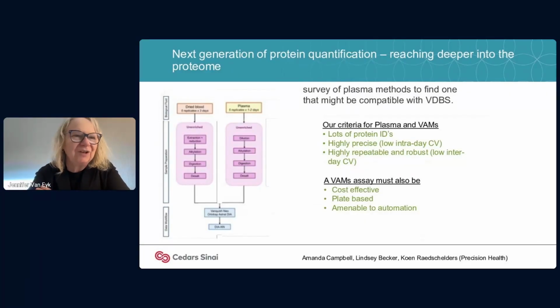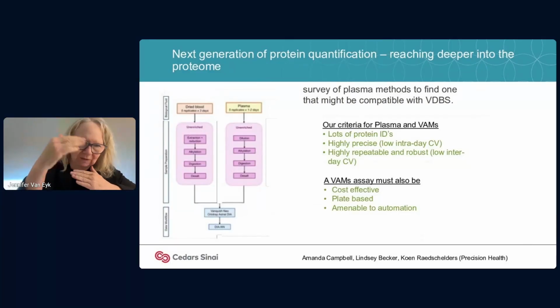Generally speaking, in healthy controls we see fewer proteins. When you have diseases, we see more proteins. And what's happened in the last few years is that these nanoparticles, different companies make different ones, essentially allow you to collapse the proteome. So you do need to see bigger changes, generally speaking.